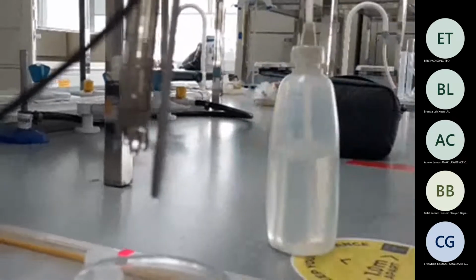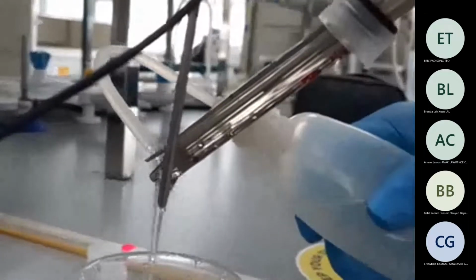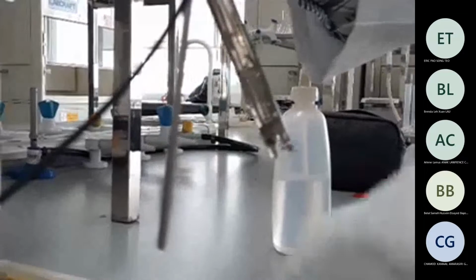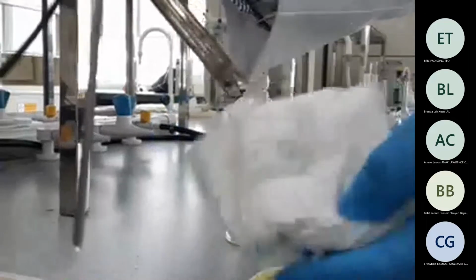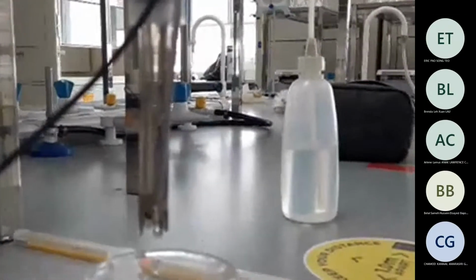Then, can you help me get some tissue paper from there? Because of its very sensitive nature, we do not touch it or rub it. Just gently wash it, and with the tissue paper, gently touch it like that so that excess water is taken away. Yeah, please do it for yourself.